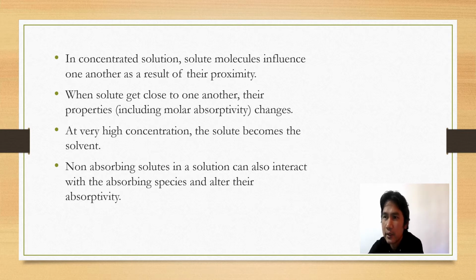At very high concentration, the solute becomes the solvent. Moreover, non-absorbing solutes in a solution can also interact with absorbing species and thus alter their absorptivity.